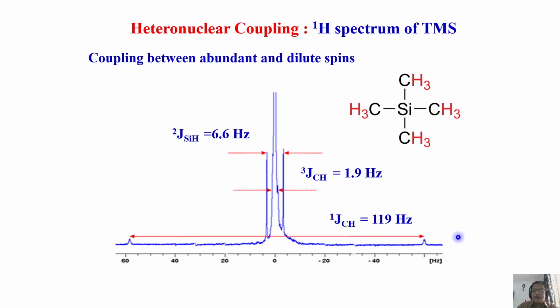But it may so happen. Remember, I was telling you, in the carbon-13 NMR, this carbon can also couple to this proton when I see the coupling. So this 1, 2 and 3 bond proton carbon coupling also can be seen. There is only one such possibility. All are equal. If I see this carbon, this is 3 bond, this is 3 bond, this is 3 bond, all are 3 bonds away.